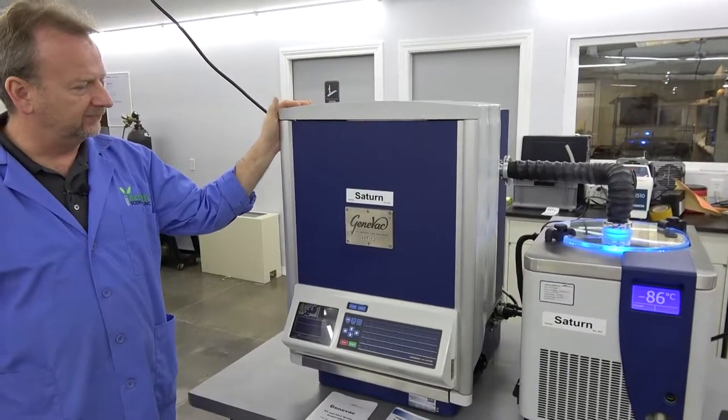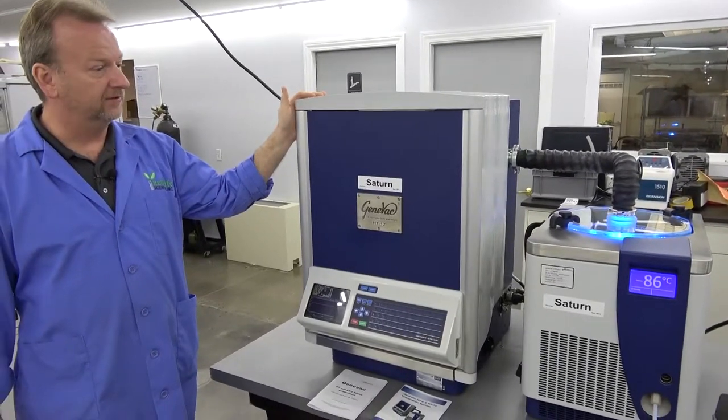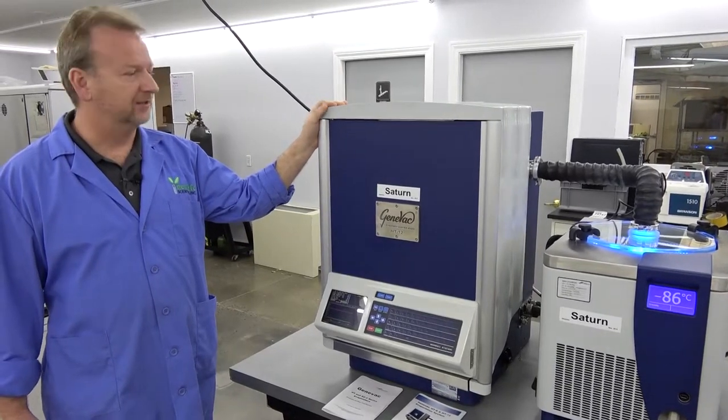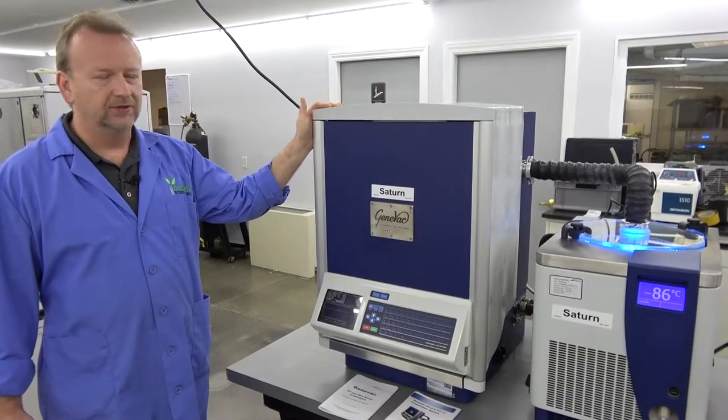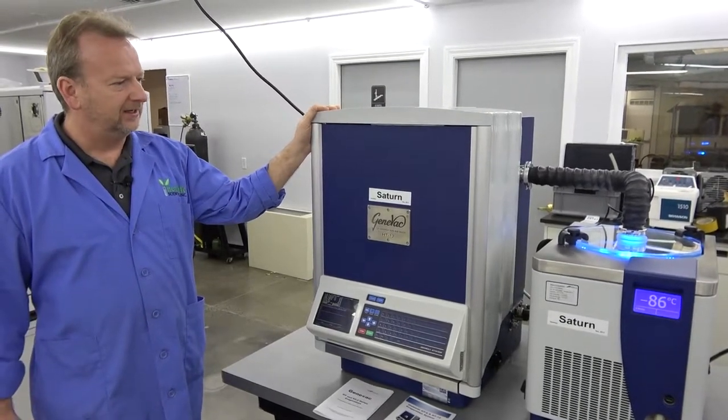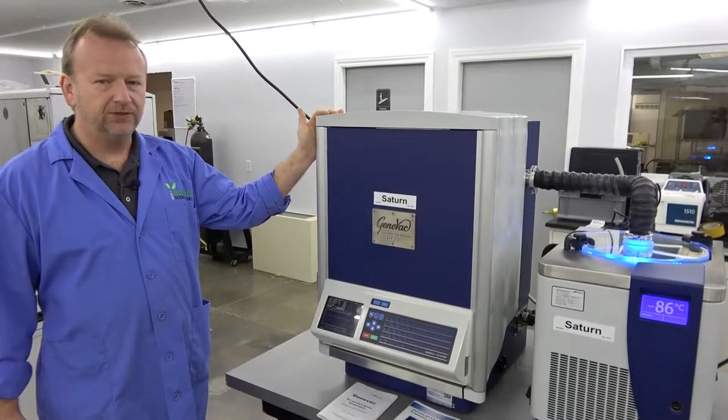We just got it in and I went through it pretty thoroughly. However, after looking at it and testing all the options, it's just in immaculate shape. I really didn't have to do anything with it. Sometimes I'll rebuild the vacuum pump or something, but I did not have to do anything with this thing. It's just beautiful.